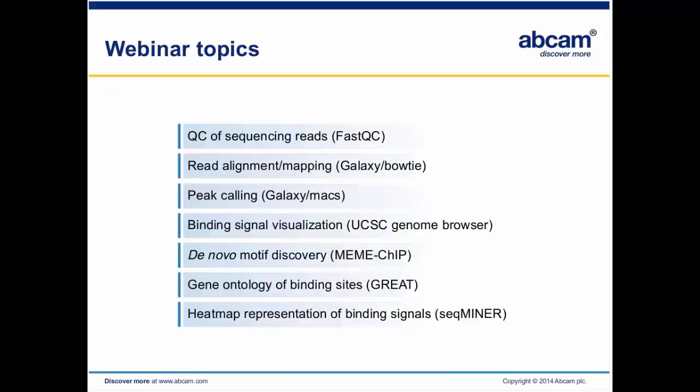Let me give you an outline about this webinar first. We will cover all the basic ChIP-seq routines by using the software listed in this slide. All the software here, they either have a web-based interface like Galaxy and GREAT, or they have a graphic user interface like FastQC and seqMINER. So no command line experience is needed here.